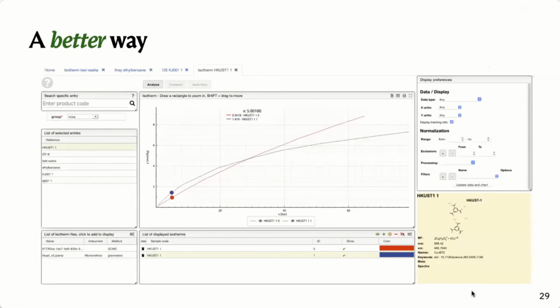You can start comparing those two plots. So you can compare your simulation with the actual isotherm, and then hopefully they are similar, but often they are not. And this overlaying of different spectra or measurements works that easily in the Cheminfo ELN, because the Cheminfo ELN, and this goes back to what Luke started, has, I think, a different philosophy from many other ELNs.